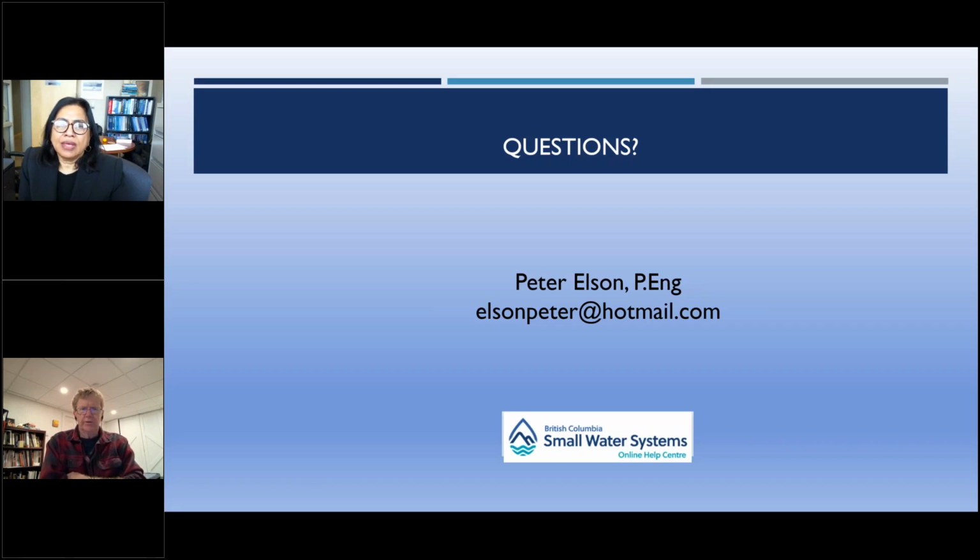Satwinder, do you? Yeah, over time we have found that HACH products are the best, the HACH field meters. I would recommend just a meter that tests only one parameter. When you're buying a meter that tests multiple parameters, they're difficult to calibrate and sometimes the readings aren't the best.